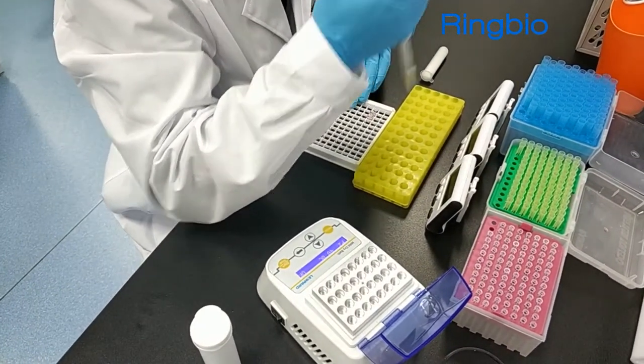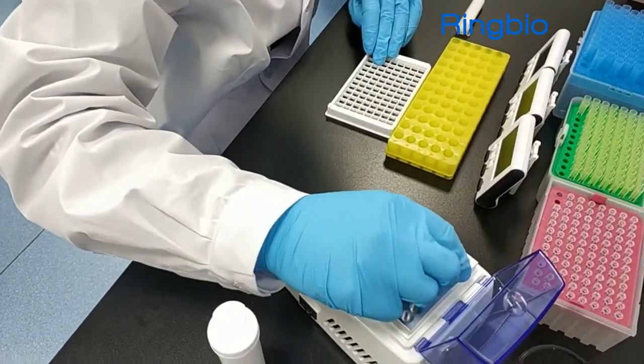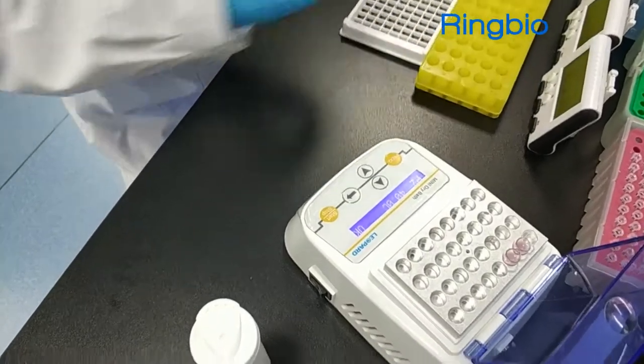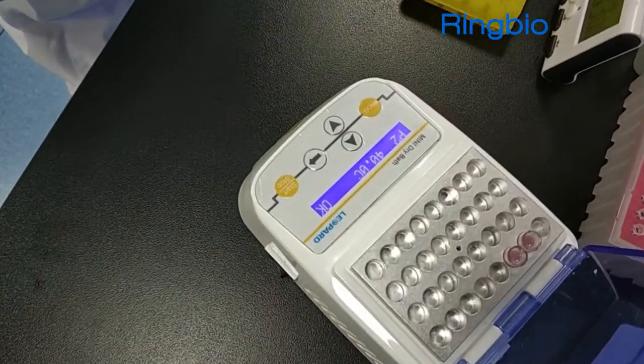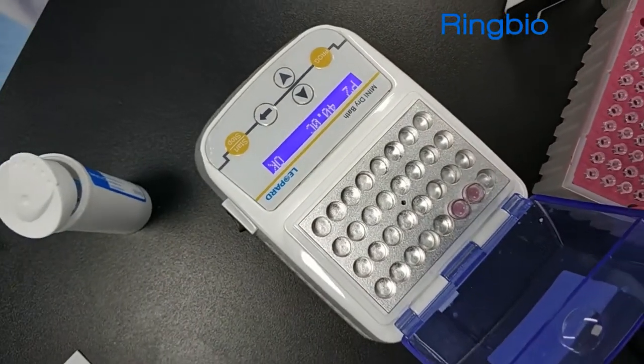Mix the milk sample with the pink reagent in the well thoroughly. Make sure to change new tips for different sample. Check your incubator is working properly and then start the timer. Incubate it for 3 minutes at 40 degrees centigrade.